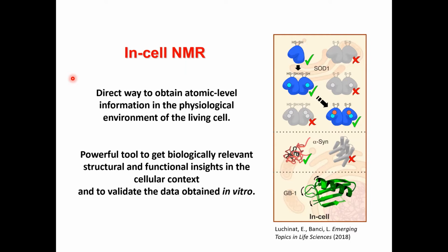In-cell NMR is an application of high-resolution biomolecular NMR, which allows us to directly obtain information at the atomic level, so with very high structural resolution, in the physiological environment of a living cell.